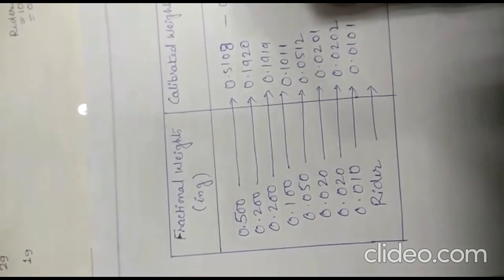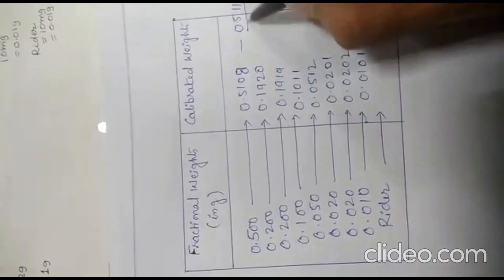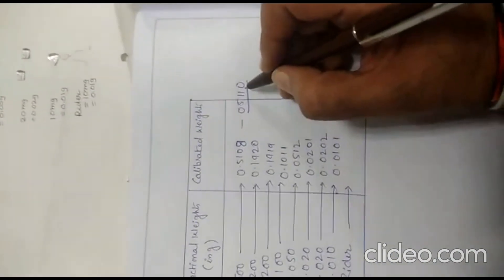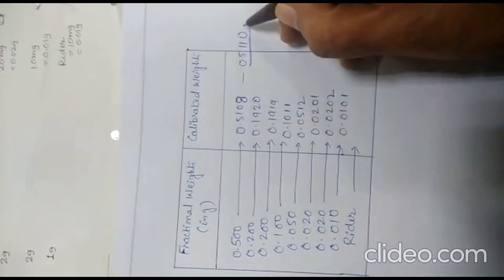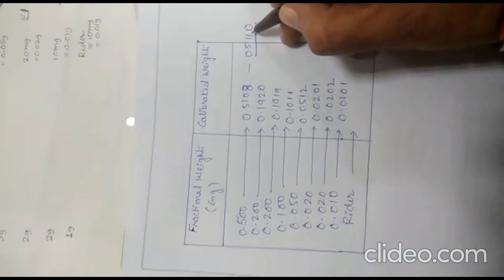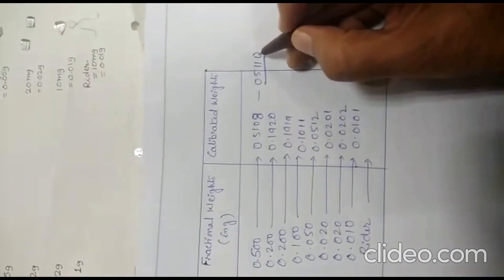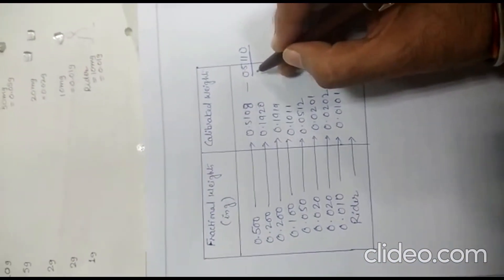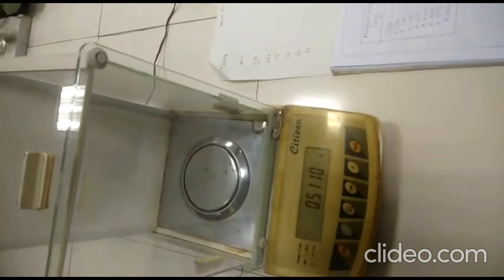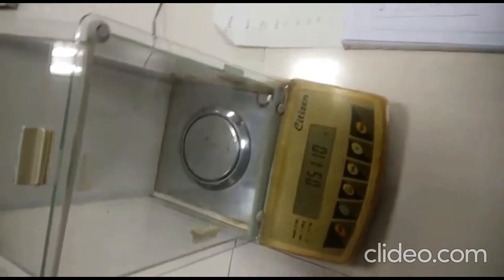So in front of the calibrated weights we write 0.5110. The exact nominal weight is 500 milligram (0.5000 g), but the actual weight is coming as 0.511 g, that is 511 milligram instead of 500 milligram. In order to reduce this error in weighing, we note the calibrated weights. This is known as calibration of the fractional weight box.